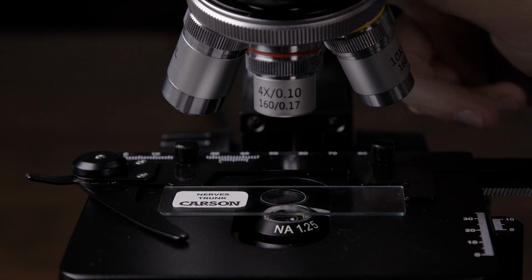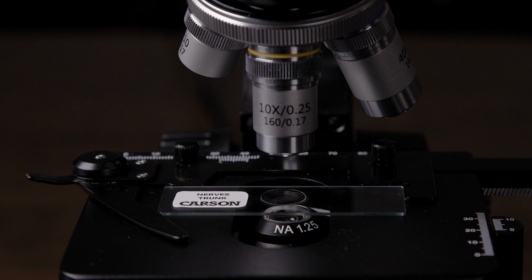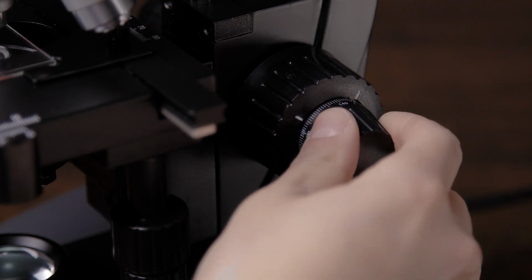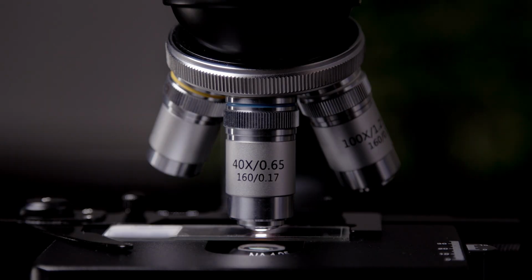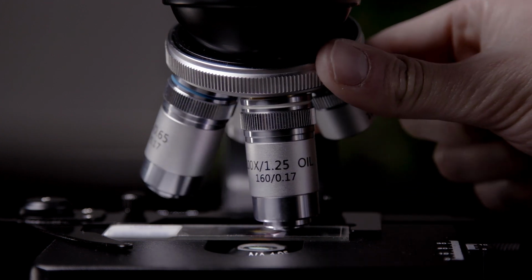If we want to continue zooming, we're going to rotate the objective towards the next power. So we're at 10 power now. You only need to refocus a little bit to get in focus at each power. You want to make sure you don't overfocus and crash into the slide when you get to the top one.